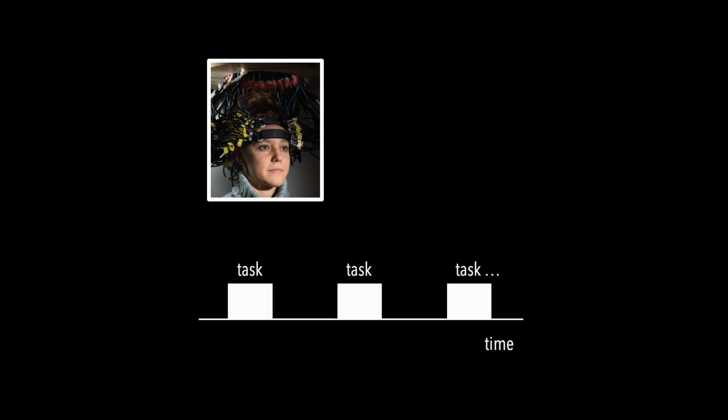To begin, consider a typical optical imaging study. Here we'll assume a task-based experiment, but the workflow we will describe applies equally to the processing of resting state data. The goal is to construct a map of the neural activity that occurred during data collection.